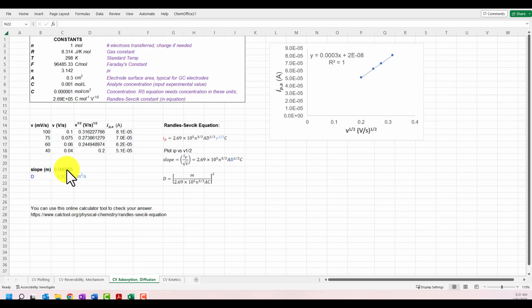And I have this automatically computing from this XY data up here. You can see that the slope is equal to all of these terms. It's y equals m, all of these terms in black, x, and there's no intercept here. The intercept goes through 0.